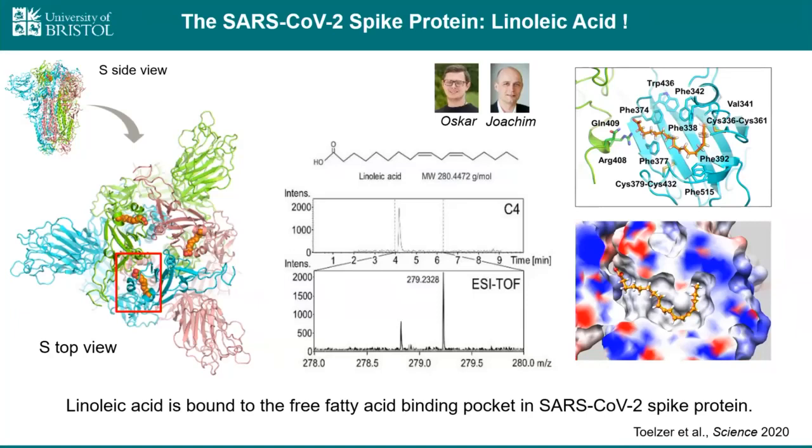And this is also shown here with the quantitative RT-PCR, where the viral genome is determined. And you can see that already at 20 nanomolar remdesivir, 50 micromolar linoleic acid, we see a clear decrease in viral replication and RNA. So in the meantime, Oskar Staufer has also tested this in another way outside of the CAT3 lab.